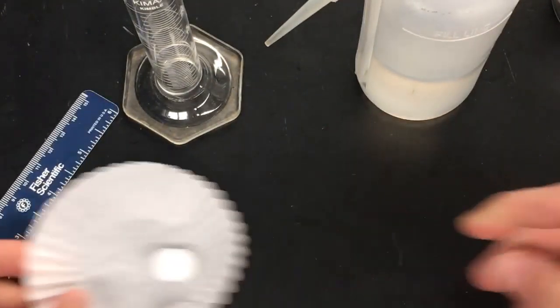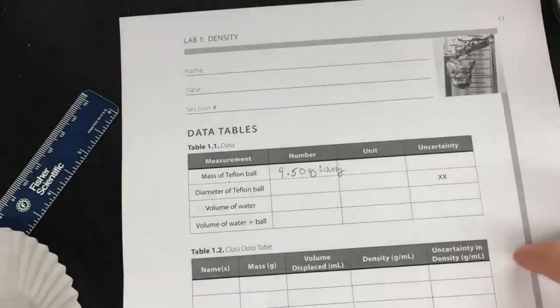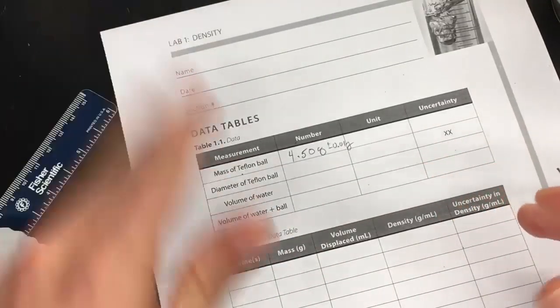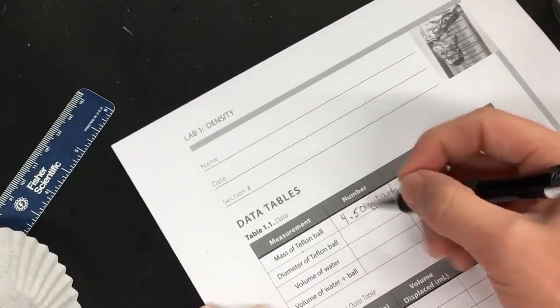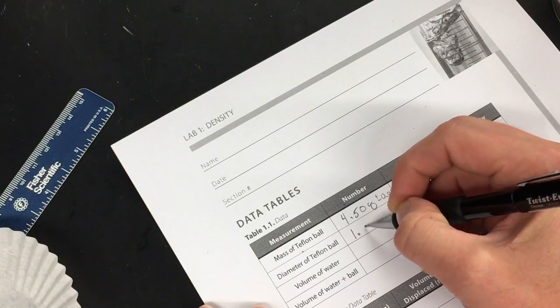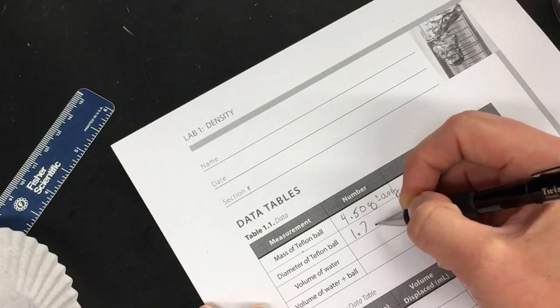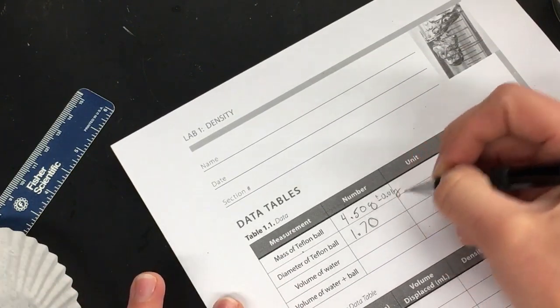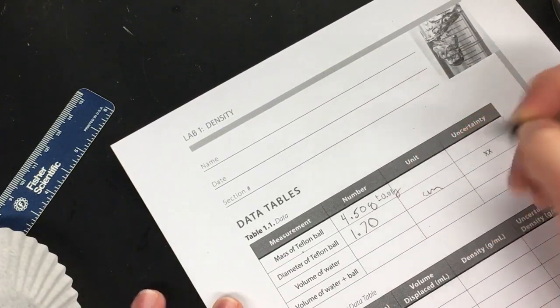Well, remember what I said earlier about the measurements for any kind of line, whether it's a ruler or a graduated cylinder. So I said the diameter was 1.7, and I said it was on the line, so that's why I can justify saying 1.70 centimeters.